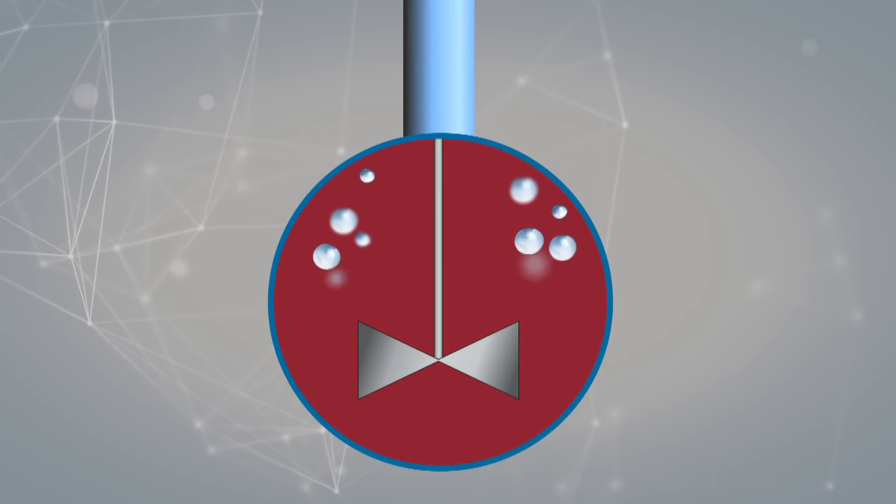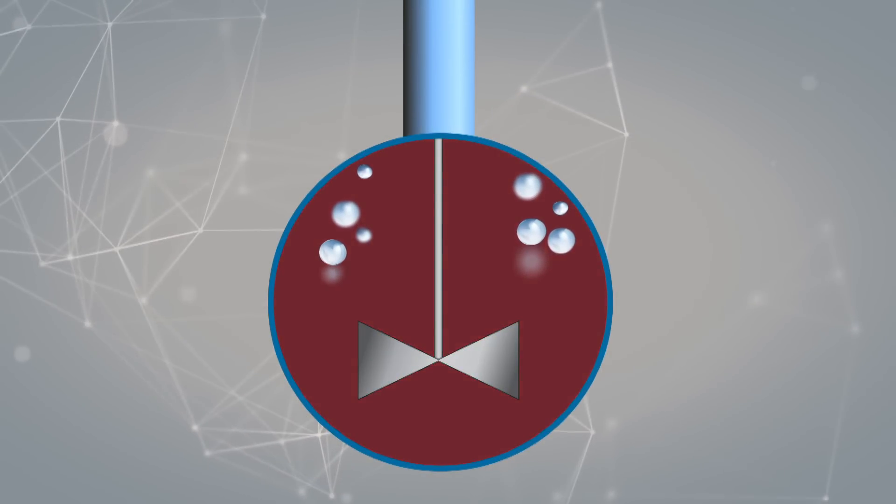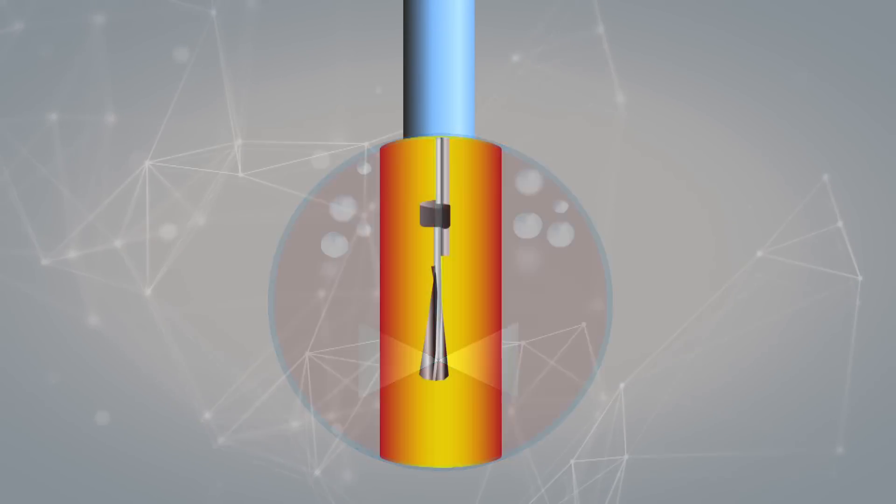Competitive cell designs can be susceptible to regions of high shear, dead zones, and trapped air bubbles, all of which have been prevented in the Affinity ITC.